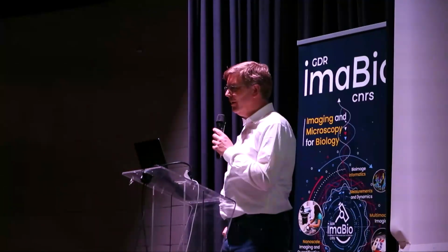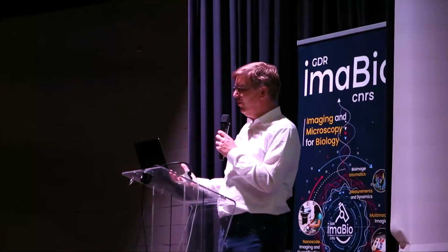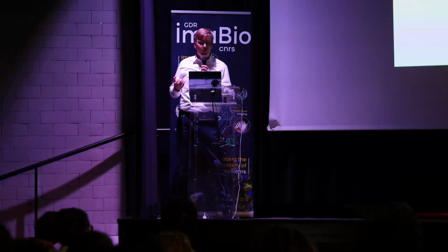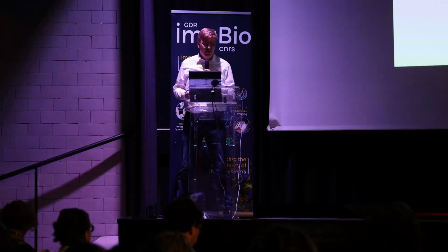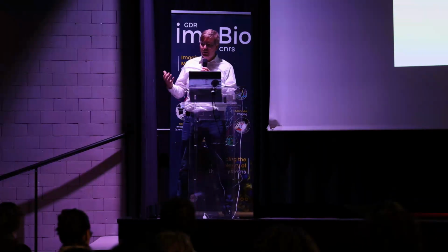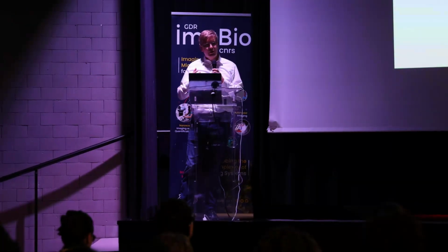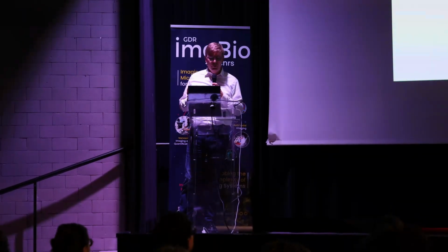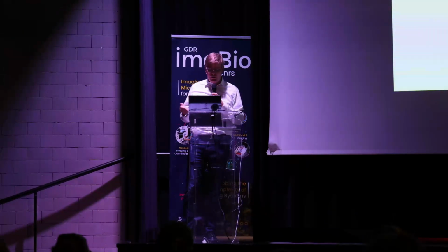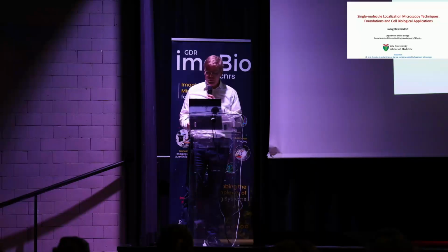So my job this morning, that's my understanding at least, is to introduce you a little bit more to single molecule localization super resolution microscopy. And I want to do a mix of giving you a little bit of an overview of the foundations, but then also talk about some of the applications we have recently developed, or some of the advances we have made on the technology development side.